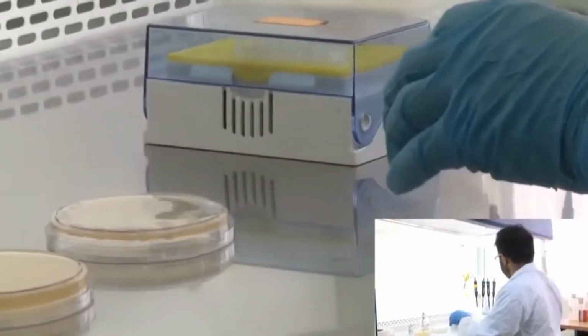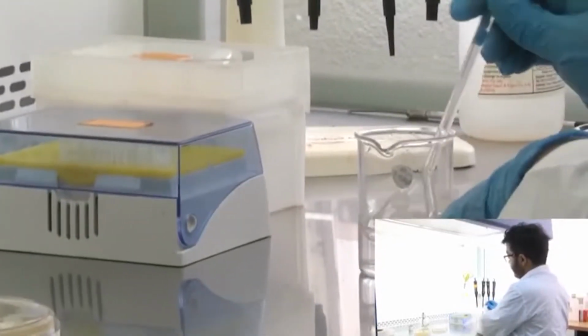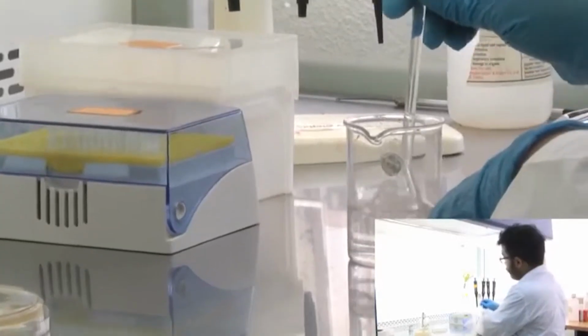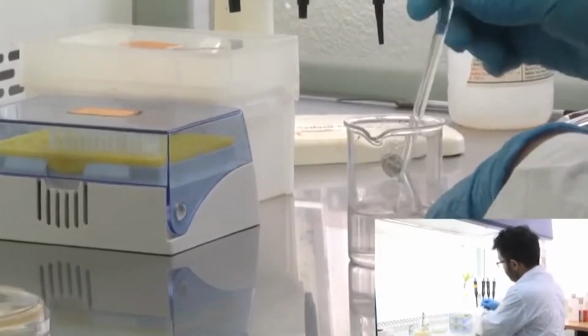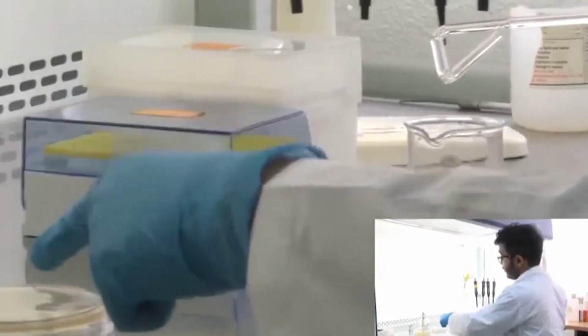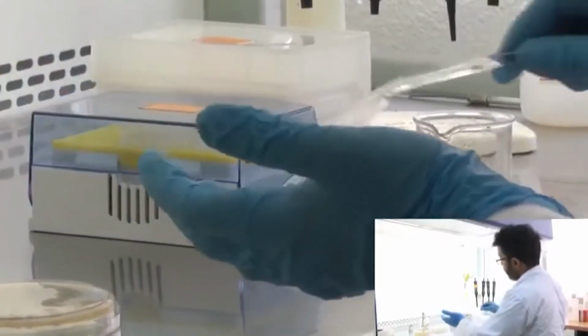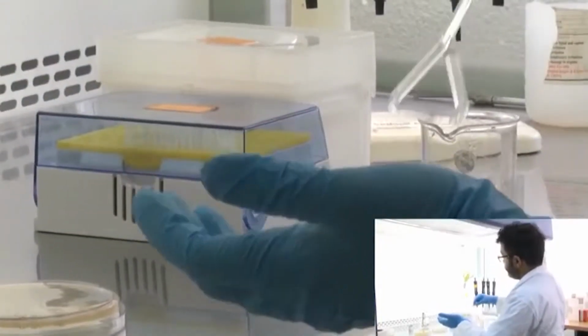Before we can begin plating, I have a glass spreader here, and it's dipped in 70% ethanol to make it sterile. Once you take it out, you add the bacterial culture to the surface of the plate after removing the lid, and then you just spread it around using this.